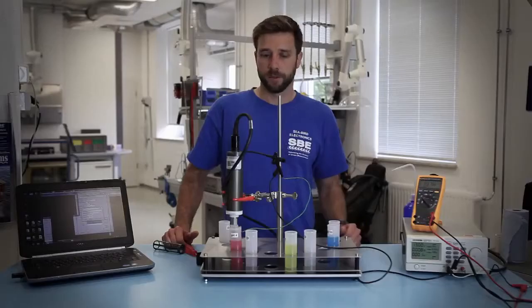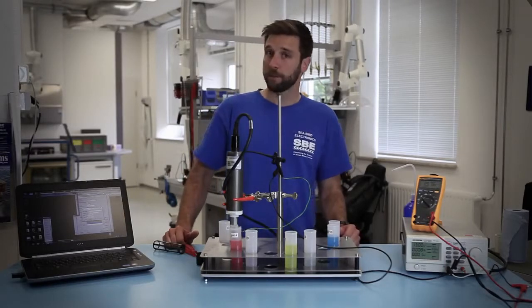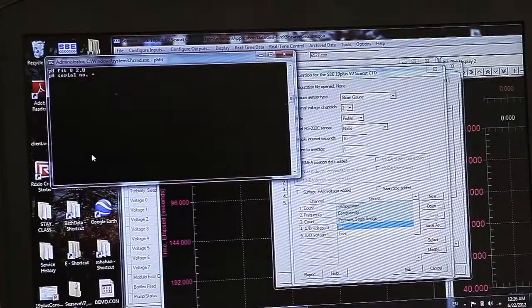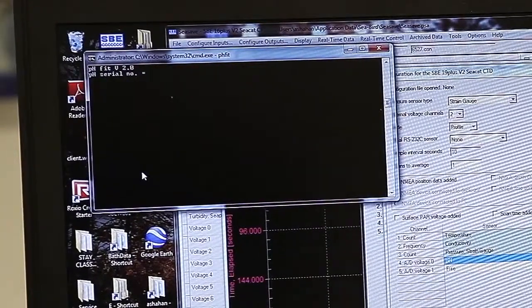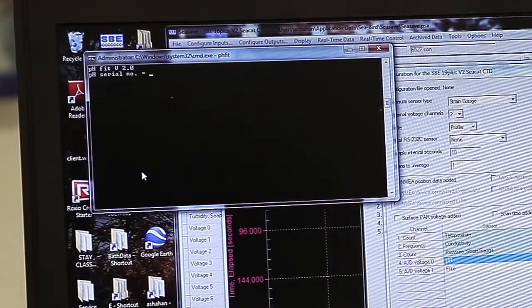Once you do have the stable voltage you'll record that in our program pH Fit. It's a DOS based program on our computer in our software package.